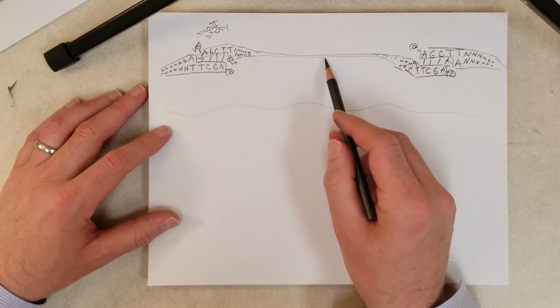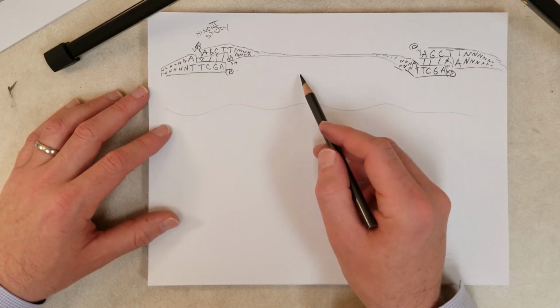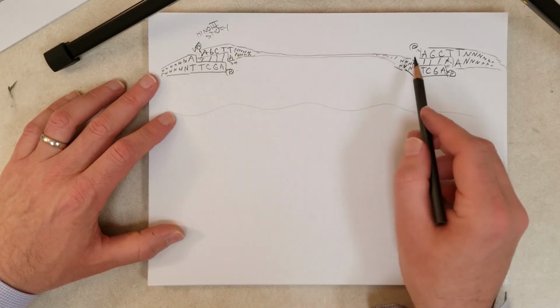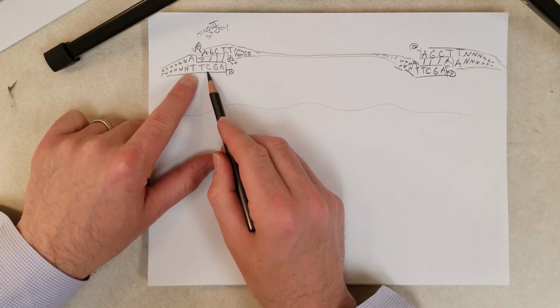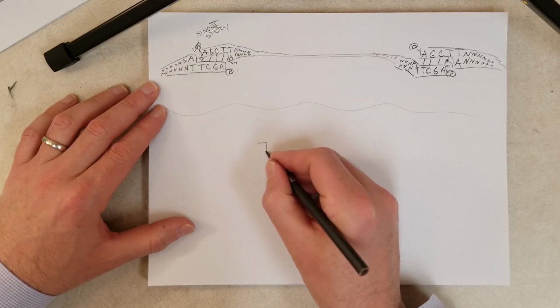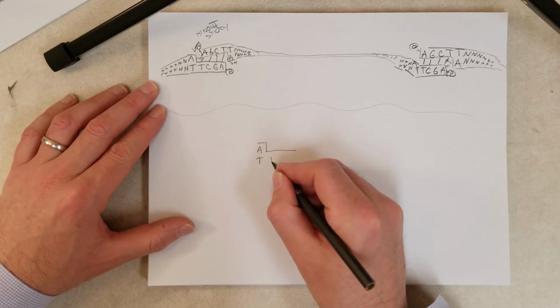Because we're just mixing the inserts with the vector in a test tube with some water in there and some buffer for the ligase. But sometimes, and we hate when this happens, this end of the vector can be ligated to this end of the vector with no insert. Okay, what does that look like? So no insert. And yeah, this is a pain when this happens.